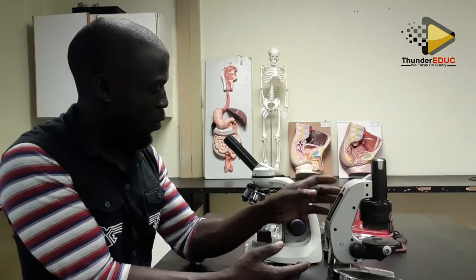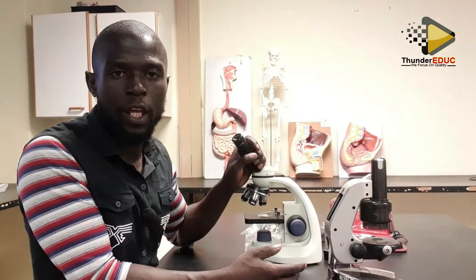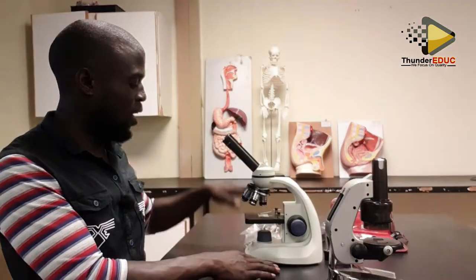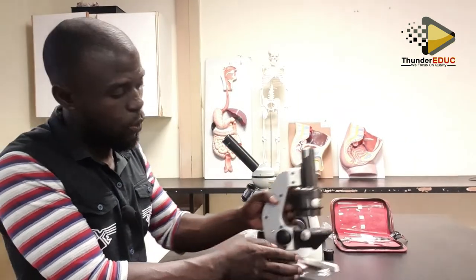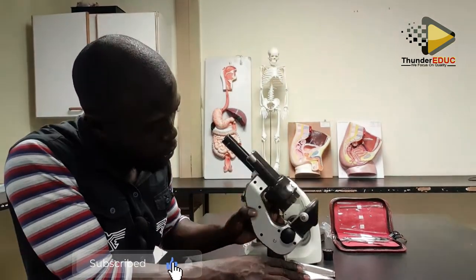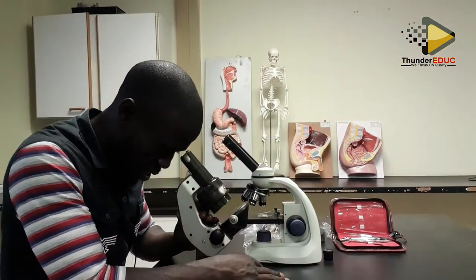Now, this one cannot change, especially if you are short. You have to adjust the level based on your height. But this one can change. You understand? It can change. If you are too short, you can turn it so that you don't have to strain. You can change it.